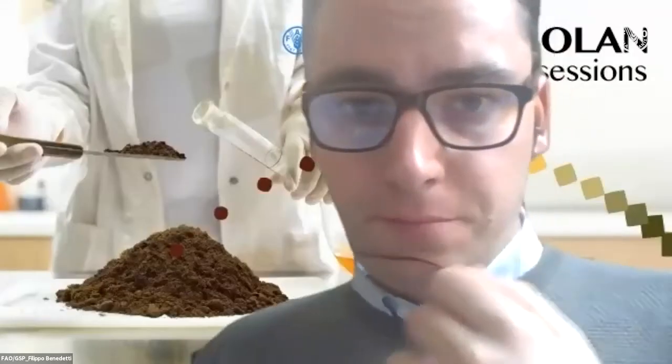Thanks, Riham. I don't know if Maya wants to add something to this answer. Maybe it's also important to make an additional filtration of the extract before using it for other analysis. It may not be so important for the EC determination, but for determination of other ions, it may be important.